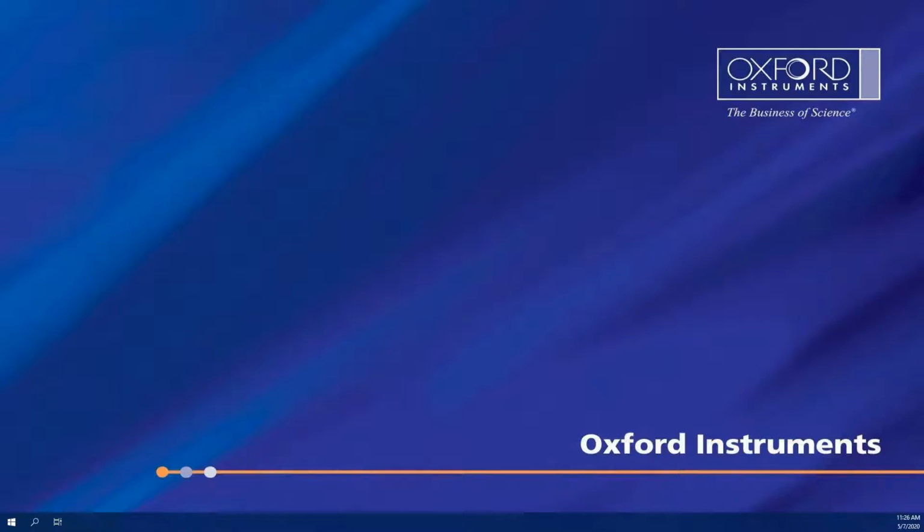So a few people asked if it's possible to stitch bright field images. Great. Thanks for the question. That's something that comes up quite often. And yes, the Stitcher can do bright field images as well.